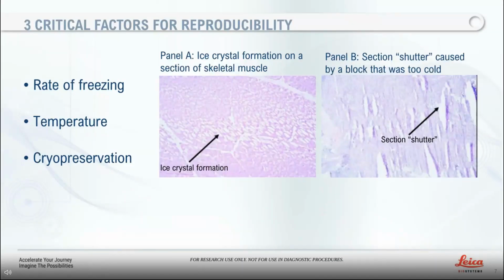The freezing rate matters because the expansion of the water content by freezing stretches and penetrates cell membranes. Slow freezing promotes ice crystal formation and thus expansion. Note that the freezing rate, not the end temperature, is critical at first.